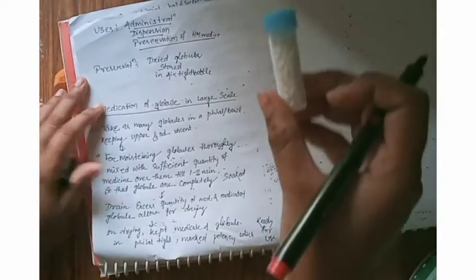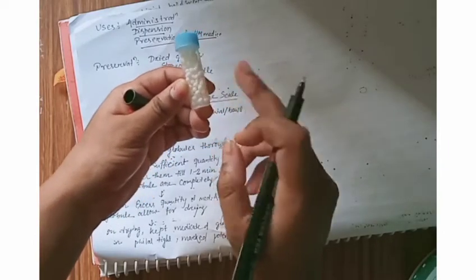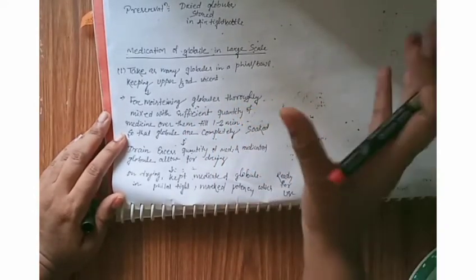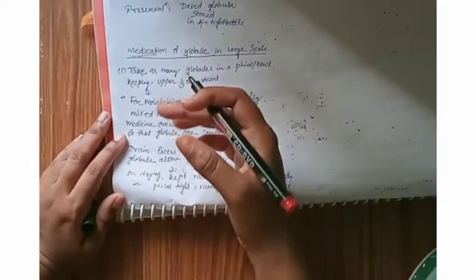Then how do we preserve? We should preserve in an airtight bottle in a dried form. Here you can see it is a dried form. Then how do we medicate the globule on a large scale? In our dispensary center there is a large amount of globules. How do we mix them with homeopathic medicine?